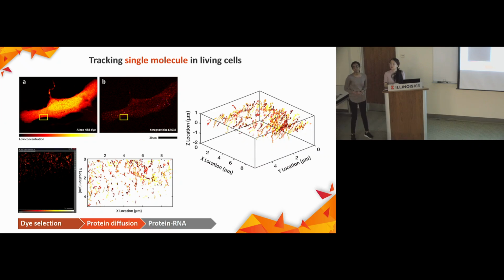But there are additional ways that MINFLUX has to double check that you're tracking them, to make sure that the fluorophore you're watching is consistent with the fluorophore that you expect you're watching, for example. Okay, cool. So that helps make sure that you're consistently following one molecule, even if there's not quite the sparsity that you expect.